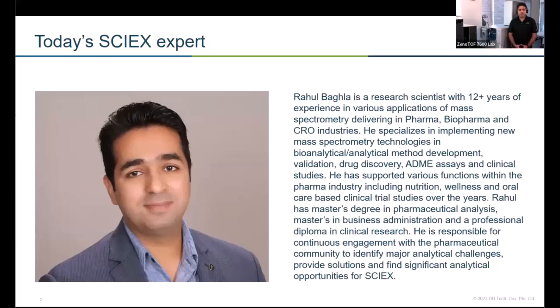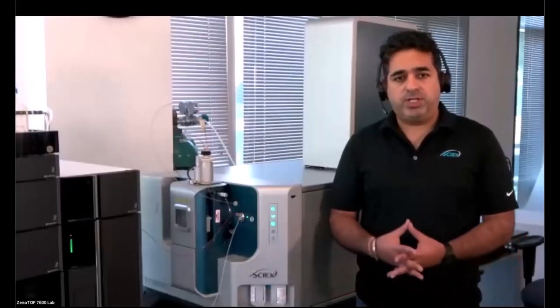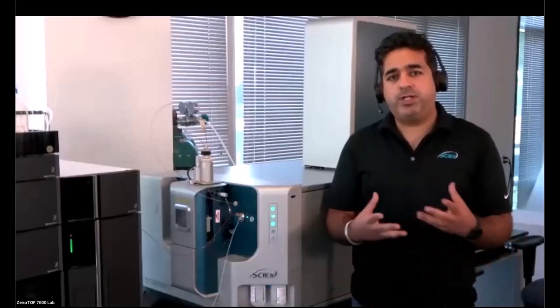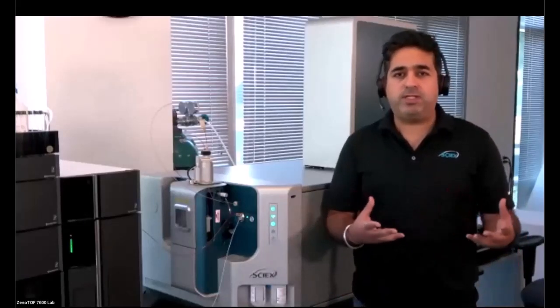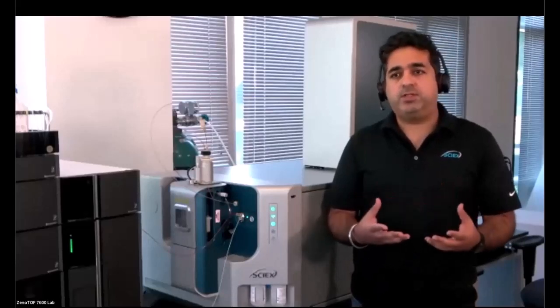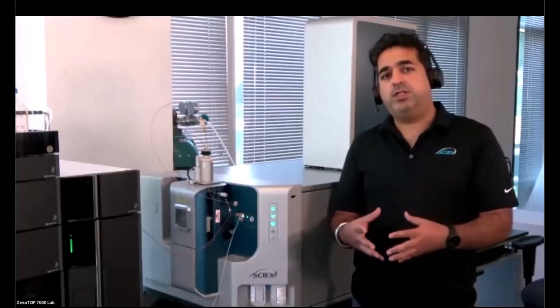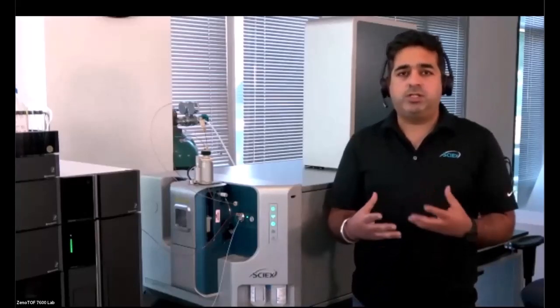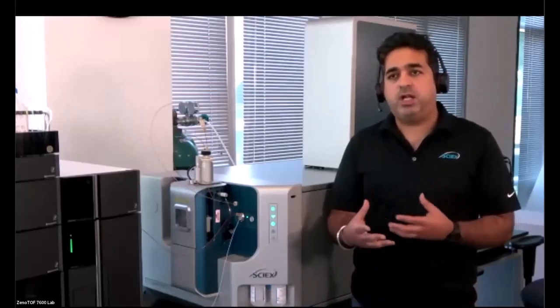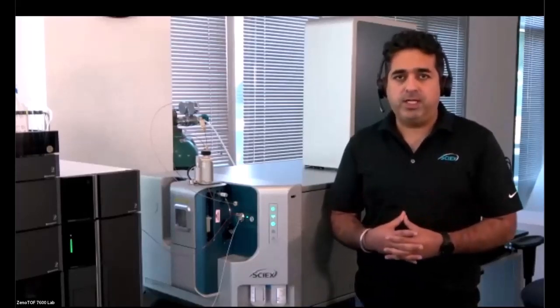Thank you, Bahar. Hi, everyone. Welcome to the masterclass today on metabolite identification from beginning to the end. In today's masterclass, we will split it into two parts. We'll have a basic presentation that will cover the basics of the instrument and the basics of the software. And then we'll go live on the instrument, and we're going to tell you how to set up the instruments, how to set up the mass spec methods, and how to set up the software for processing data.